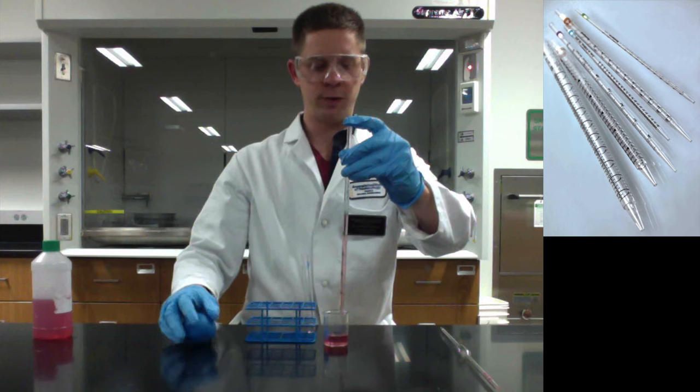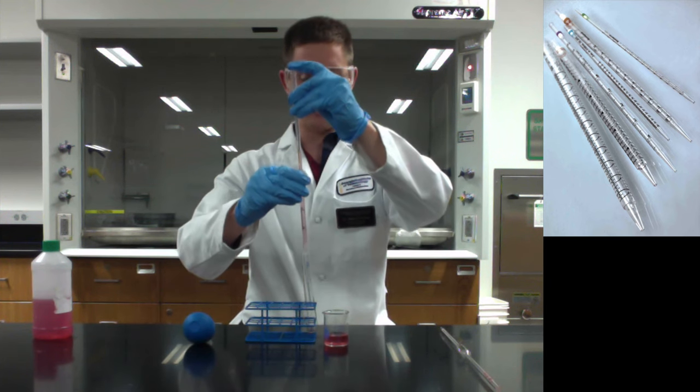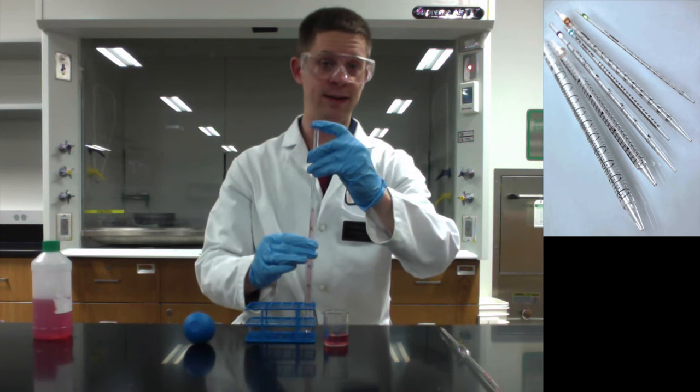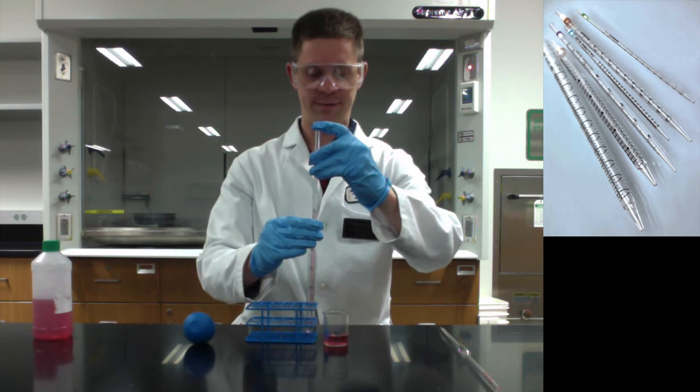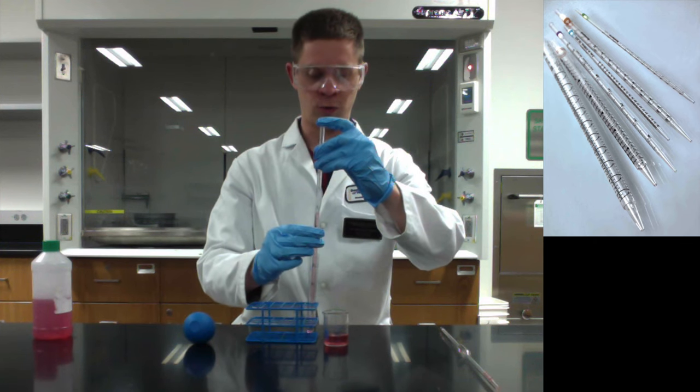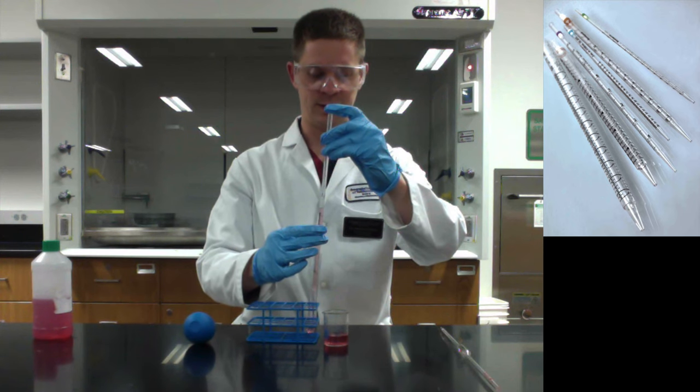So we want to deliver 2.6 milliliters and so at this point I can transfer this over here to the test tube where I'm ready to deliver and use the exact same technique I just used. Essentially very gently twist the tube or kind of let up pressure off of my finger and allow the liquid to be delivered.